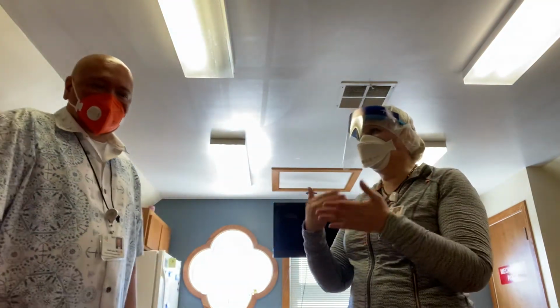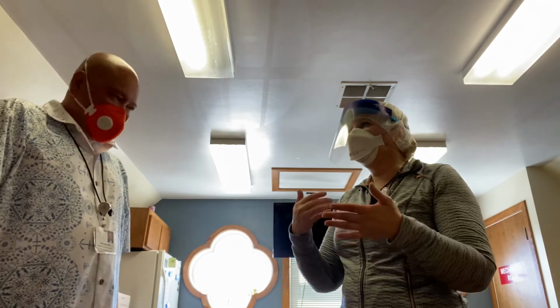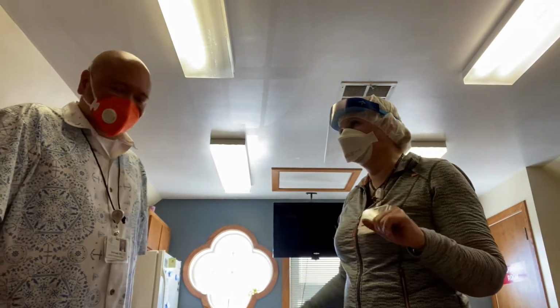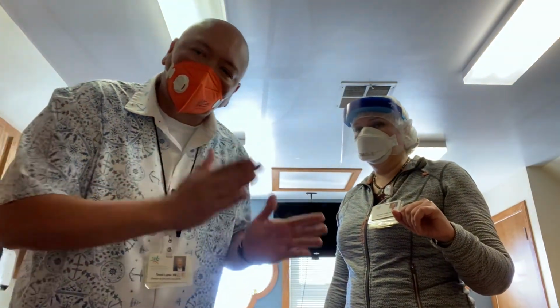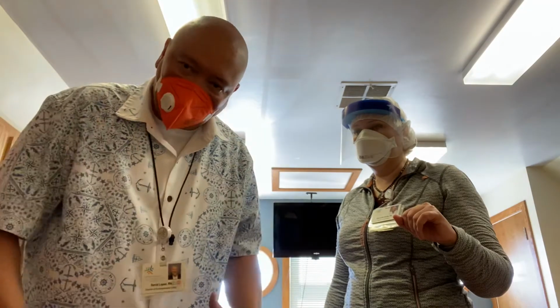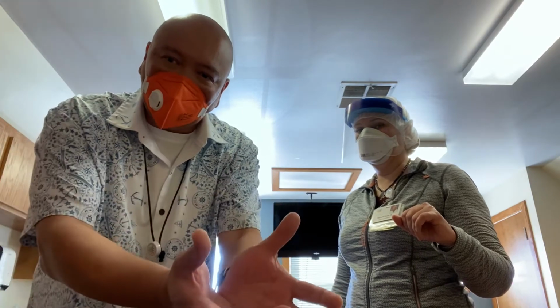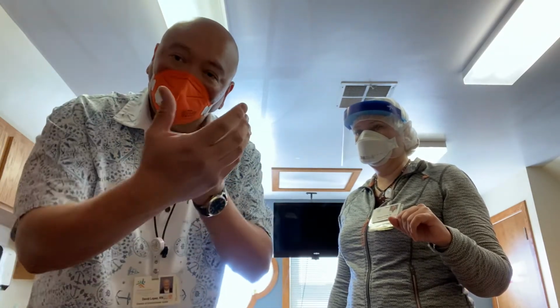I've tested. If I have no more patients to see, if I were going to go see another patient, I would leave everything on and only change the gloves. Correct. So the difference here is when she goes back, earlier, when she had the gown, every time she touches a patient or takes care of a patient, she sanitizes, she removes the outer glove, puts on another secondary glove, and then proceeds to the next patient.